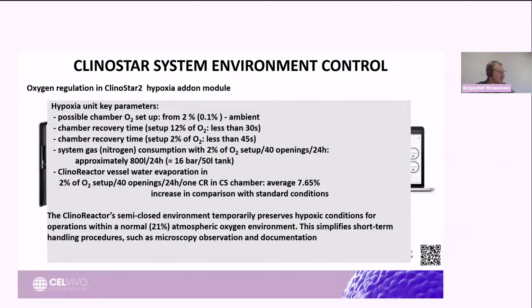Of course, the longevity will depend on your setup. The higher the oxygen level, the longer it will be preserved. And this will allow you, for example, to do imaging using a normal microscope without the necessity of having a hypoxic chamber for your microscope.